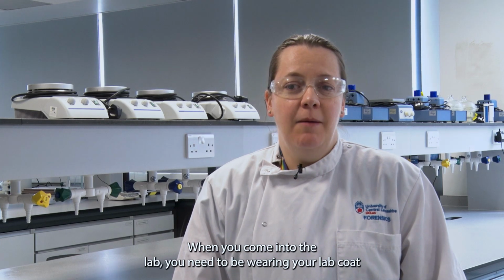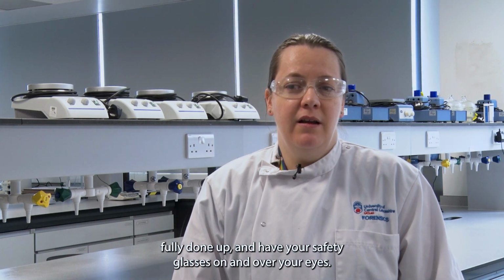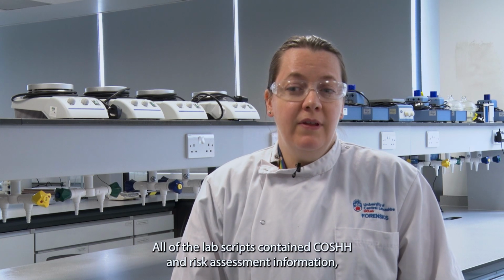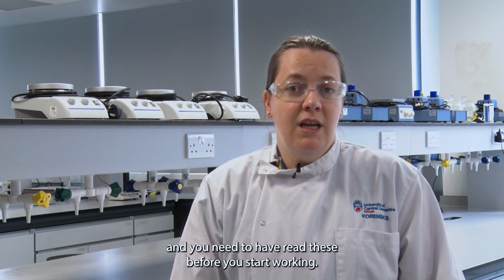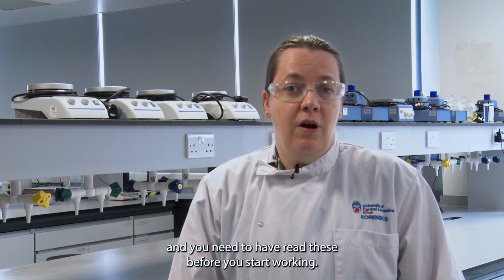When you come into the lab, you need to be wearing your lab coat fully done up and have your safety glasses on and over your eyes. All of the lab scripts contain COSHH and risk assessment information, and you need to have read these before you start working.